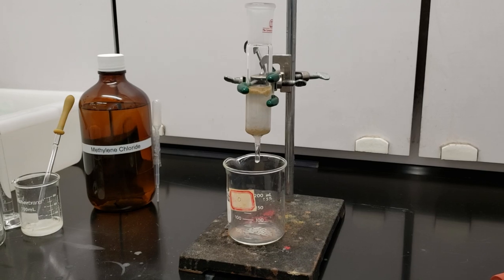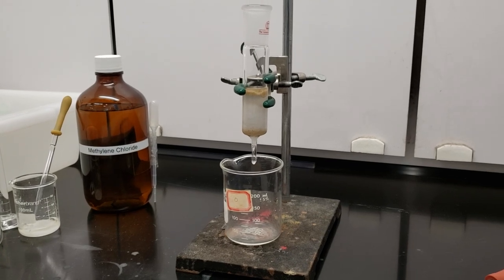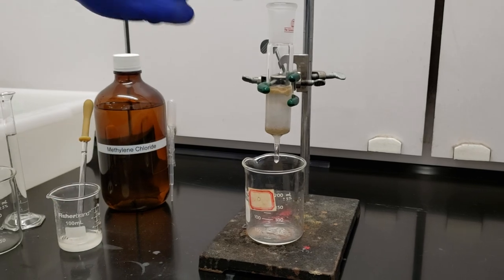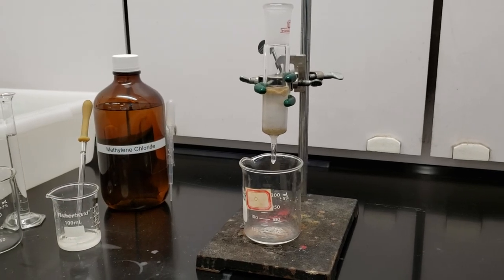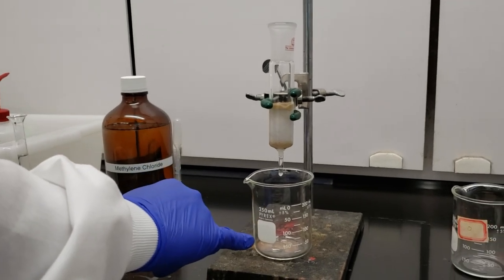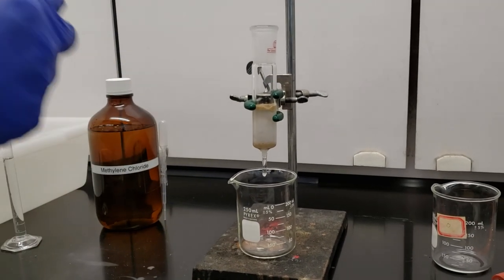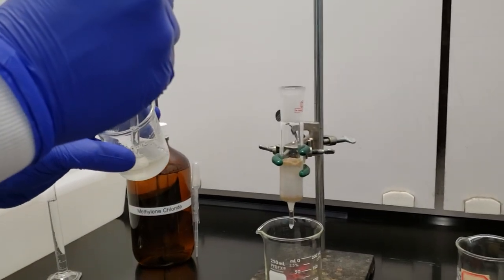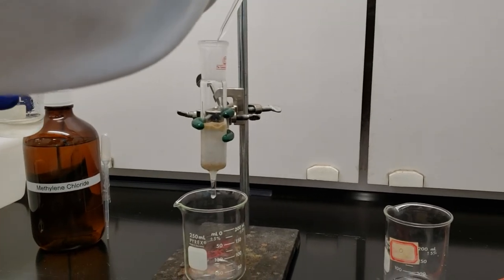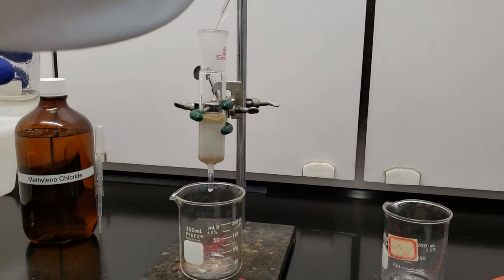All right, so we'll let that drip for a second or two. We'll prepare our solution and get ready to put our product in ether solution onto the column for separation. We place a pre-weighed 250 ml beaker underneath our column. I'm going to go ahead and draw up our diethyl ether solution into our pipette, and I'm going to add that onto the top of the column.